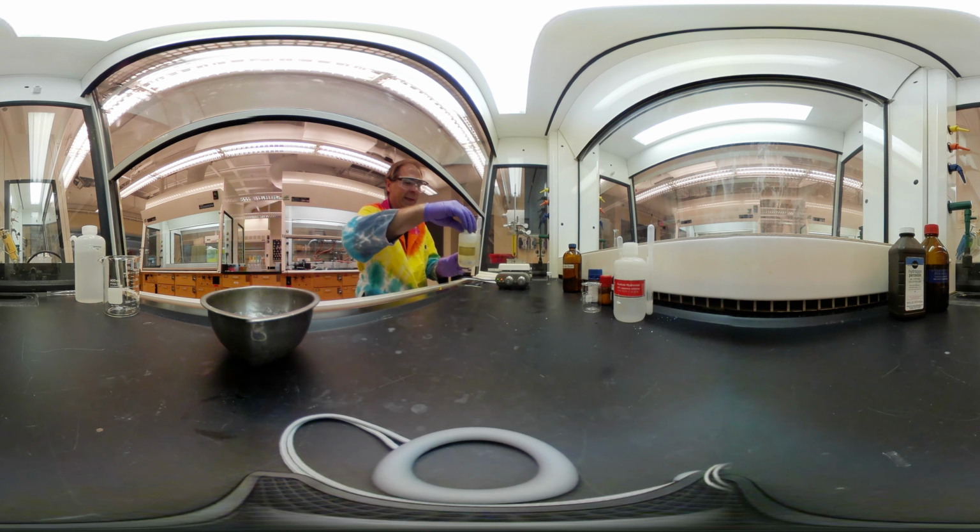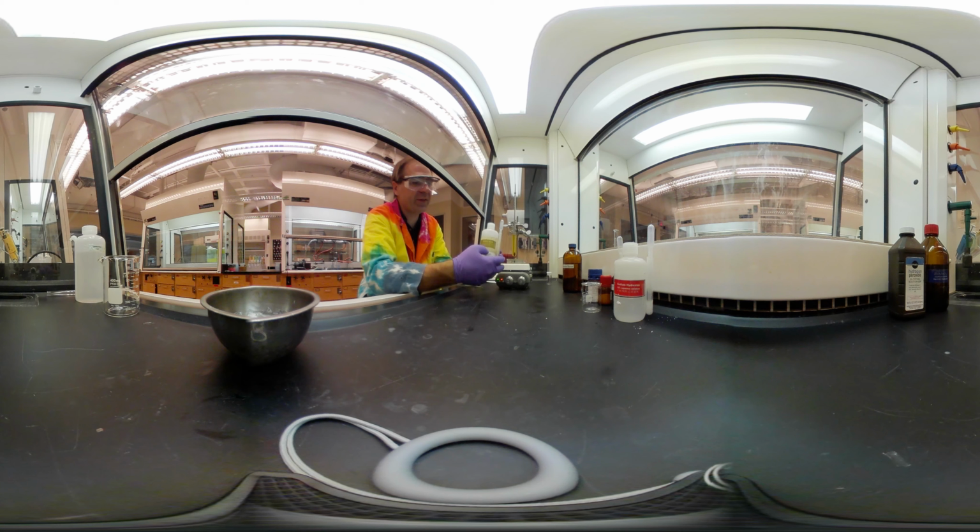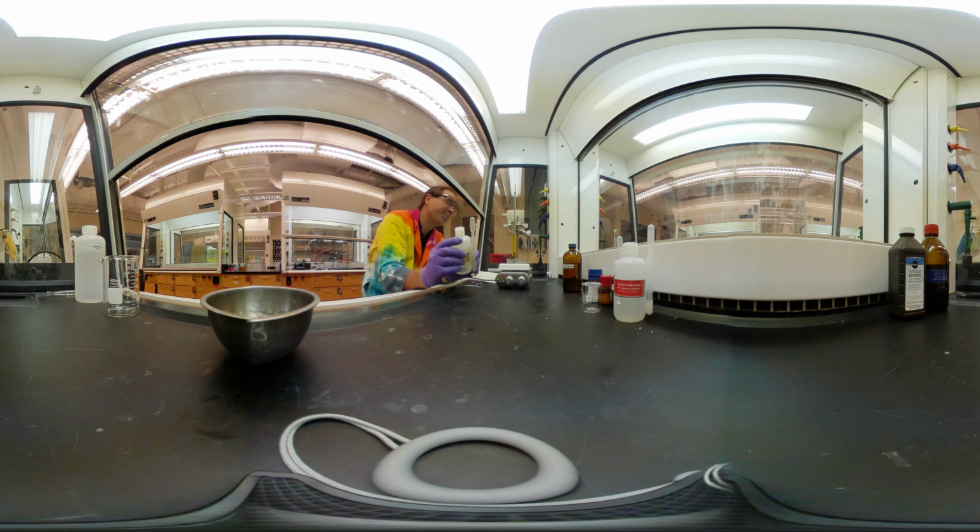Now, glacial acetic acid, even though acetic acid is just the acid that's in salad dressing, that is really low concentration, 5% weight per volume. This is glacial. This is concentrated. It's as concentrated as you can get. And I think that's 17 molar. I love the label on this. Caution, causes nasty skin burns. So that's why I'm wearing my gloves.